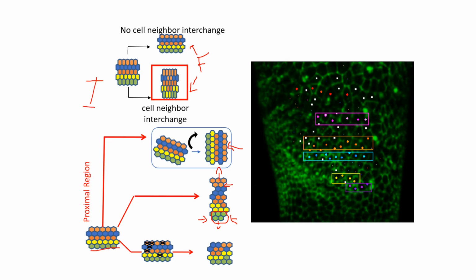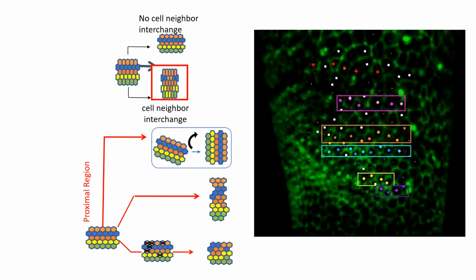So we made here, you see one line in purple, you see a second line. We try to make it as straight as possible. We make this third line and we make a fourth line here. And this is just an example. We made more lines here. For example, you can see a red one here. But just to make it clear, I just wanted to show you that. Now I'm going to play the movie, the different lines.